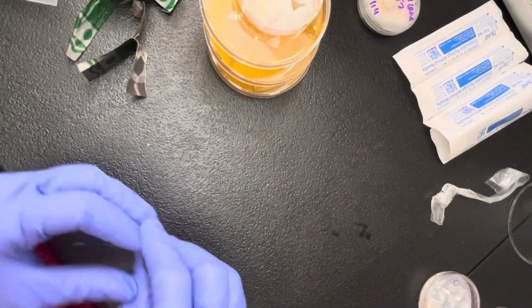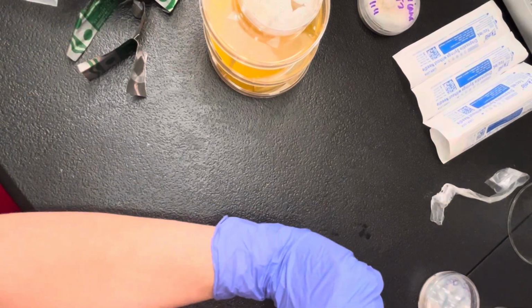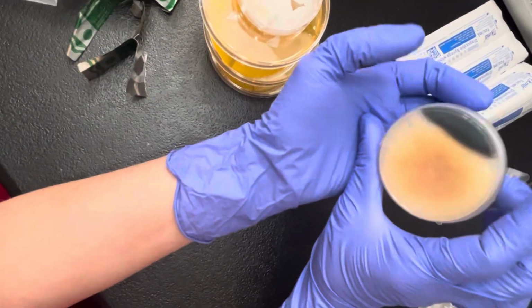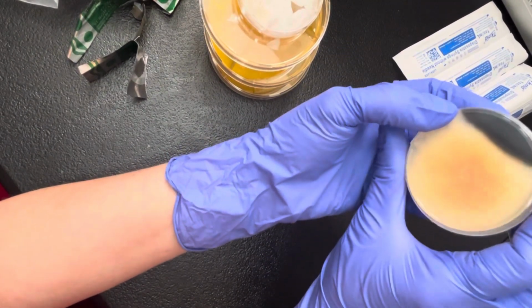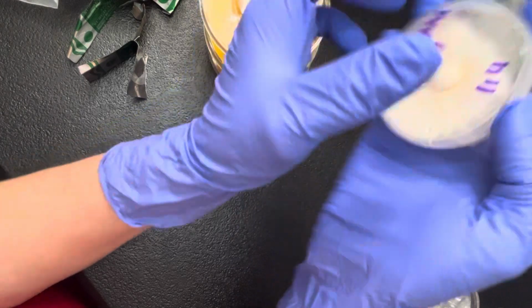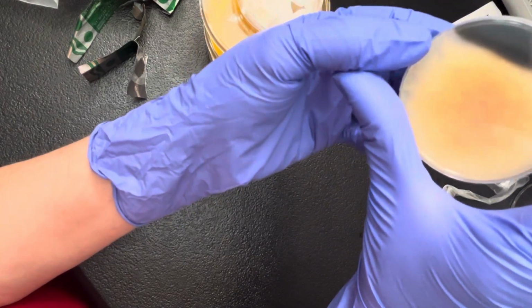So now we have one that is for sure just disastrously contaminated here that I want to grab. I will save this one for last. This actually looks like black mold to me, so I feel like maybe I don't even want to open it. But it's really important for you to decide when it's worth opening it and when it's not.